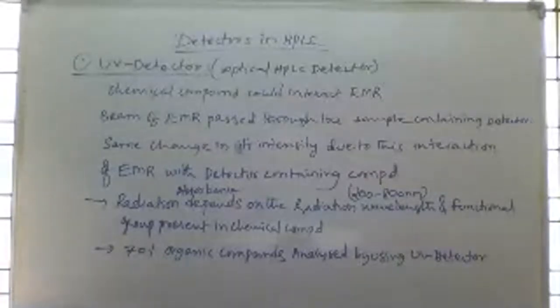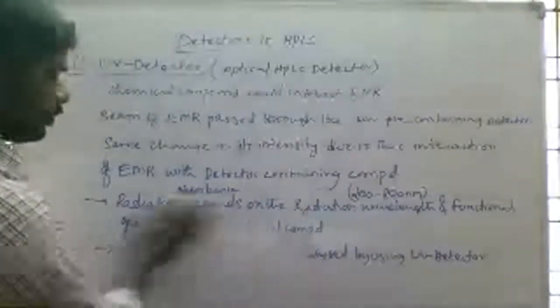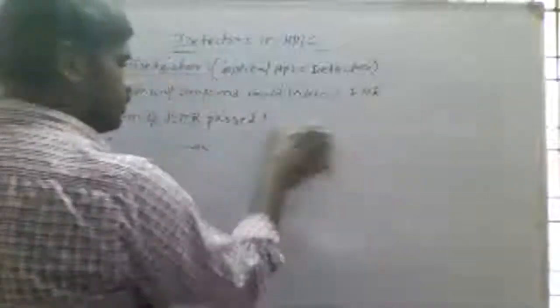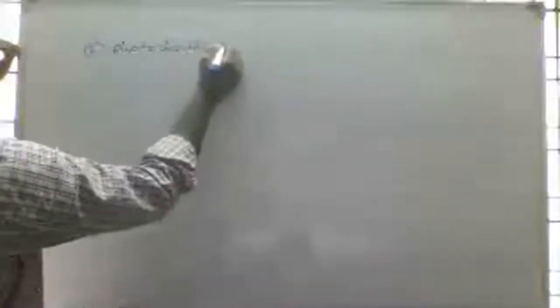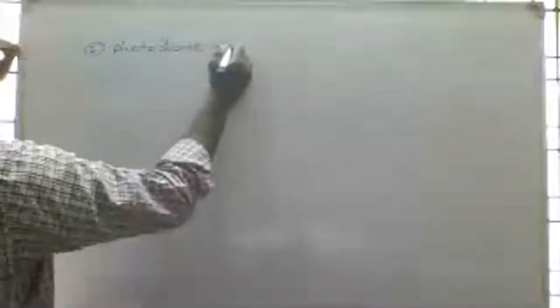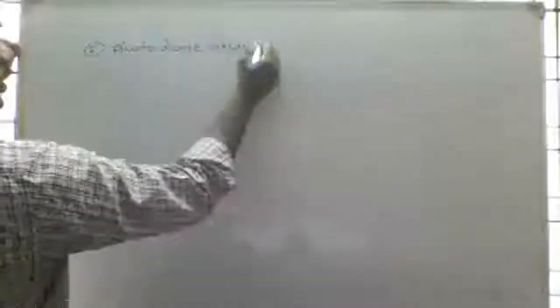Next, the photodiode array detector. The second one, the photodiode array detector.